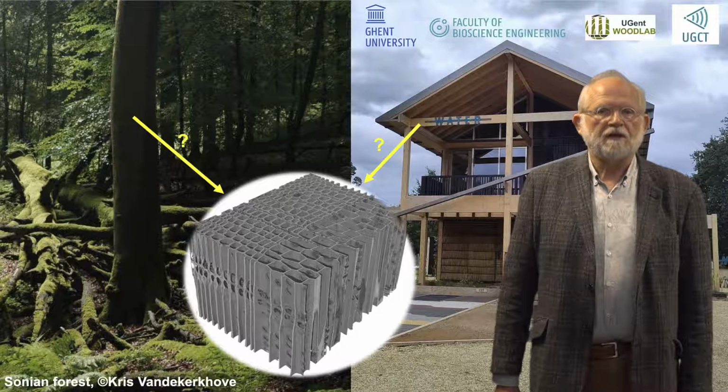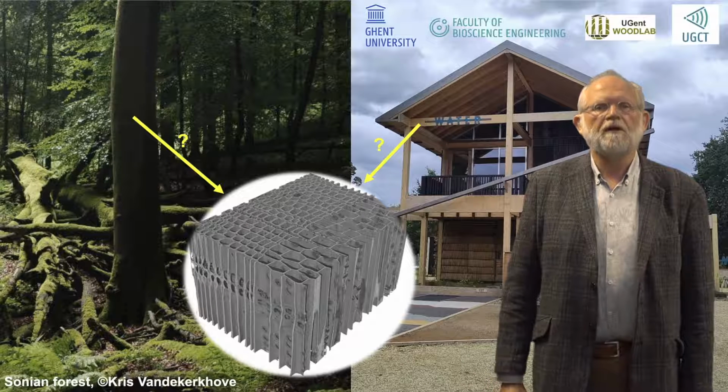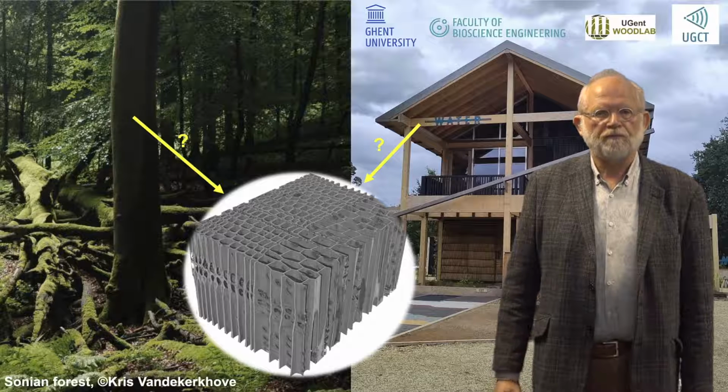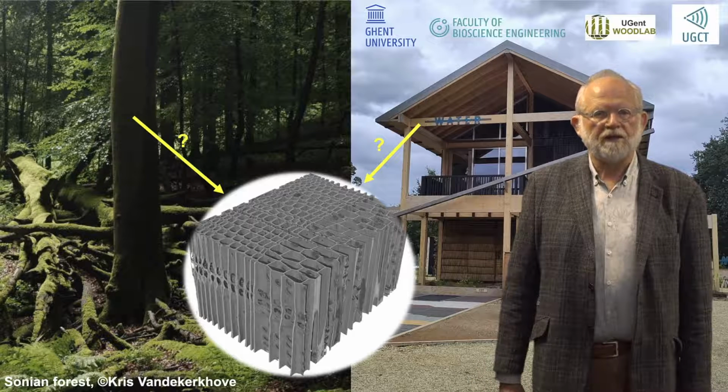My name is Joris van Acker, and together with my colleague Jan van der Bulcke, we will give you a couple of examples of how we use X-ray computed tomography. For more than 15 years now, we have our X-ray glasses on to look at wood. In living trees, but also for looking at engineered wood products.